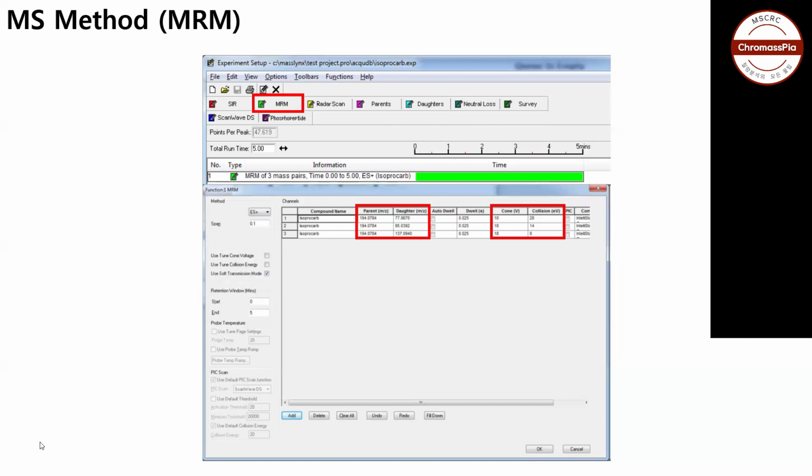Because the low intensity ions create ambiguity, we have to be sure they are coming from this parent. So we should select the low intensity for the PIC out of these three. Yes. Okay. Thank you. Any other questions, please ask. I am done for this.